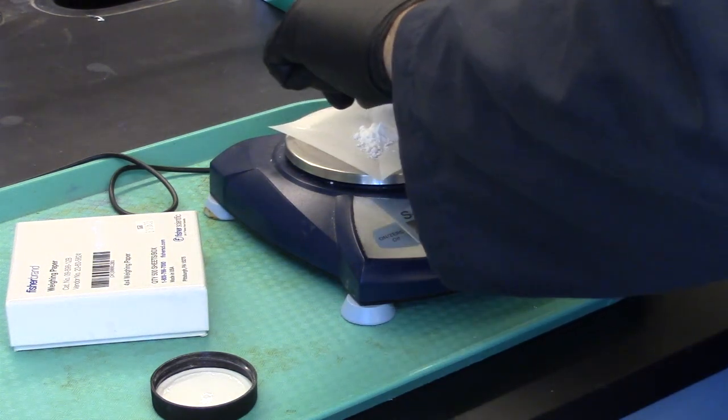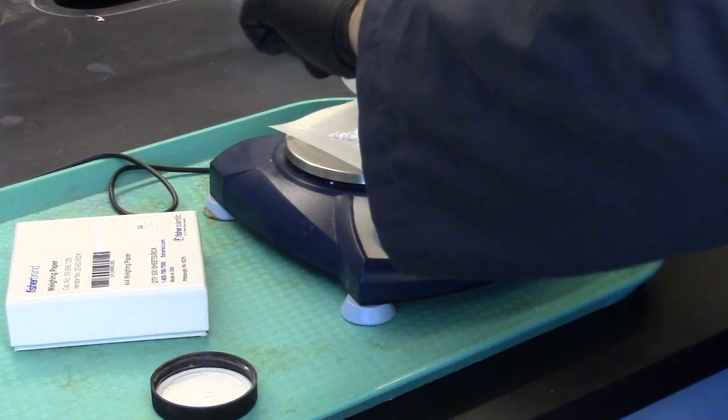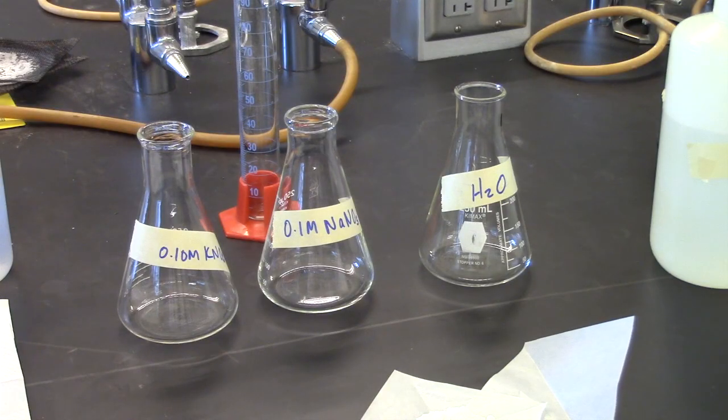You will label three Erlenmeyer flasks and three beakers as following: 0.1 molar potassium nitrate, 0.1 molar sodium nitrate, and water.